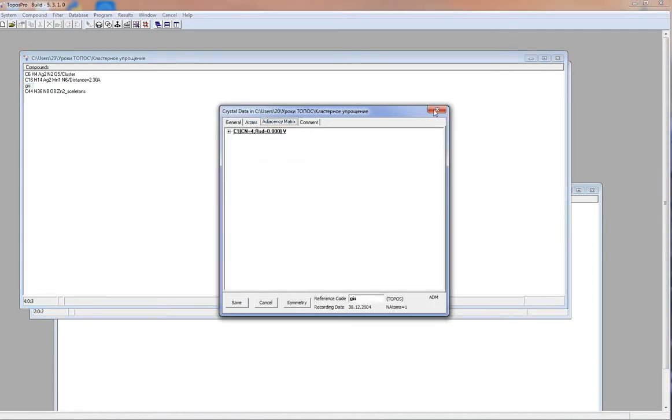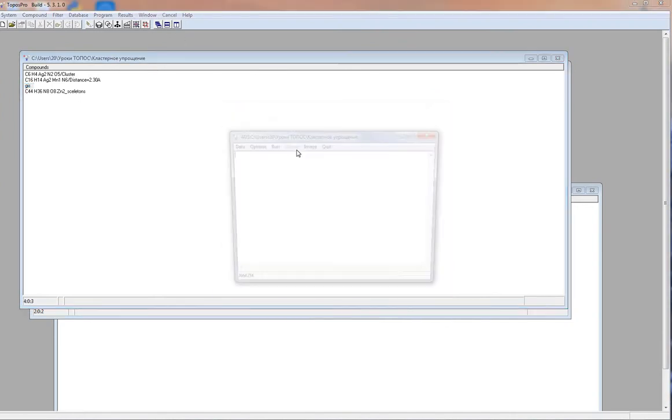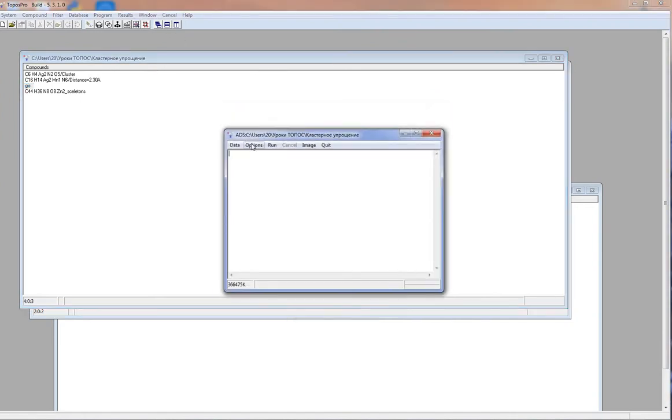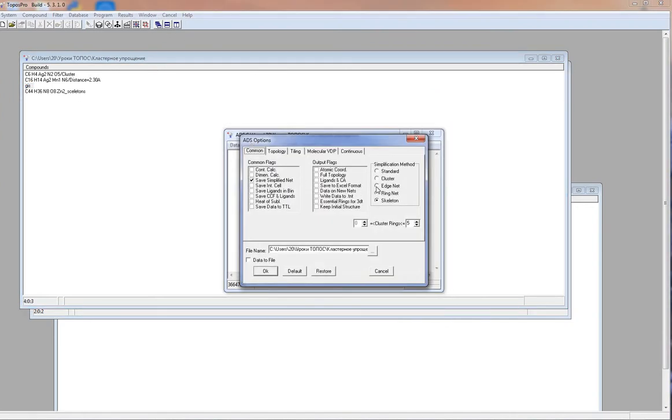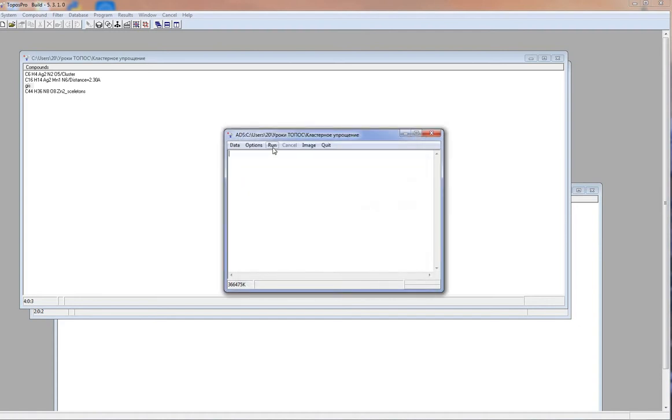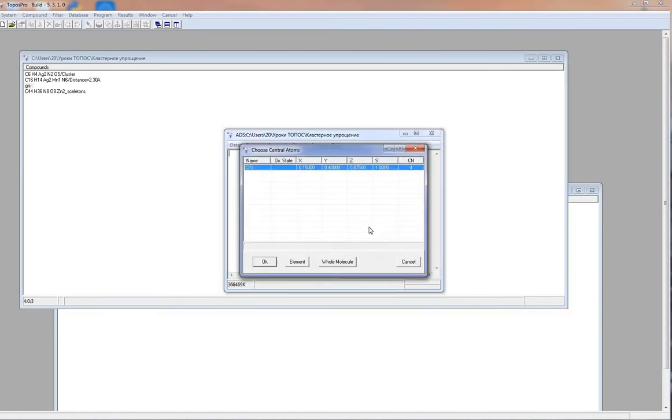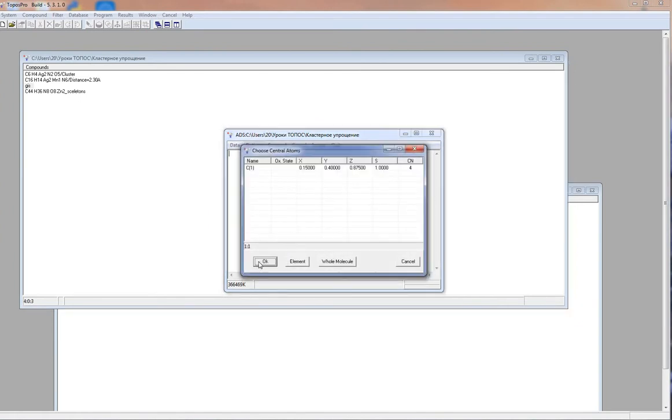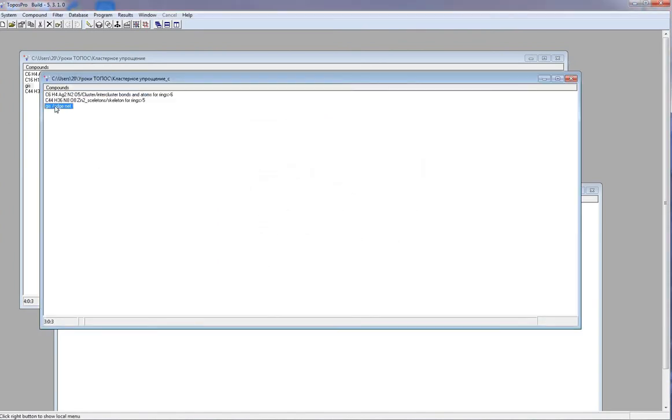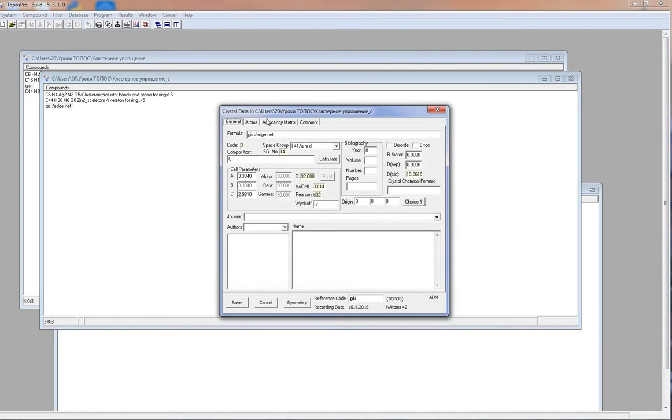Open ADS, options, save simplified net, simplification method, edge net, run. Now we have simplified net. As you can see, it has 2 6-coordinated nodes. We can determine its topology.